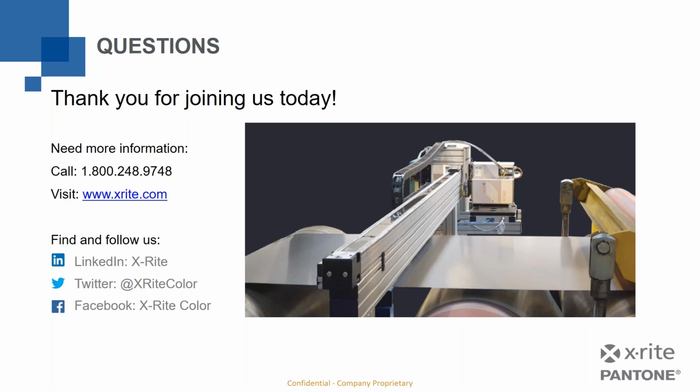All right, another question we have here, which is about number of measurements and lamp life and those kinds of thoughts. So these devices are obviously made for a production environment, as I've mentioned numerous times, right? And made to take a lot of measurements. I think we have devices that will measure as quickly as one measurement per second. So obviously that does lead to some wear and tear on the lamp, right?